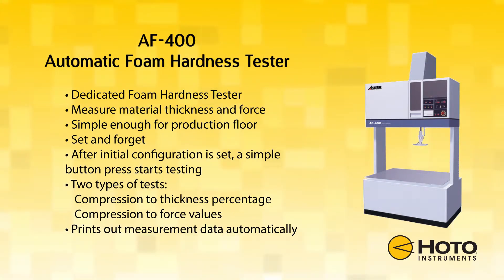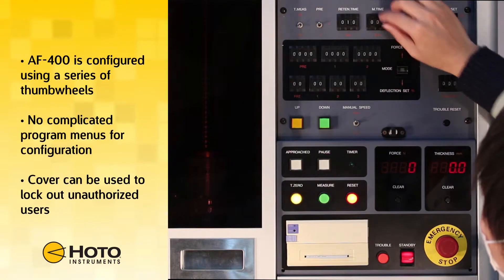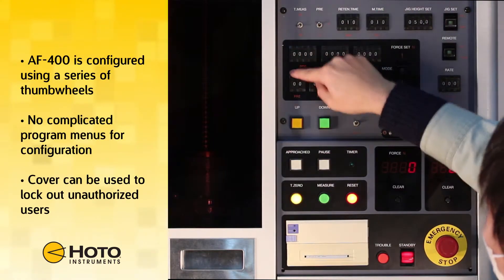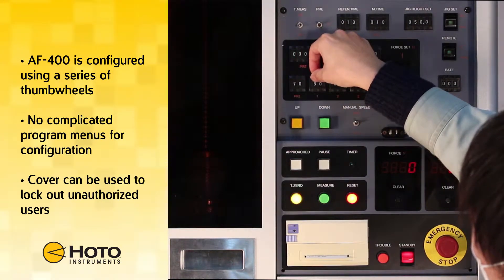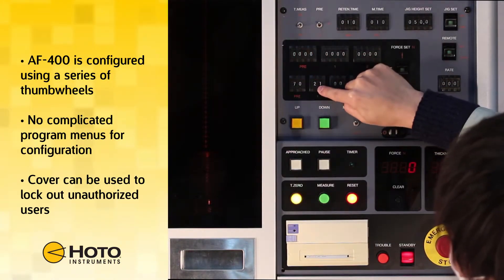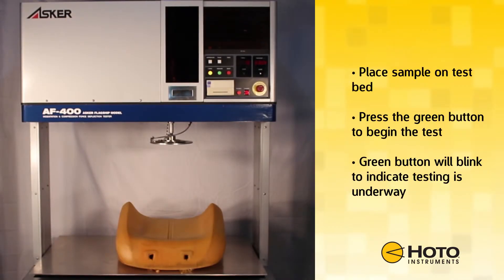Once tests are completed, the measurement data will be printed out automatically. The AF400 is configured using a series of thumb wheels. No complicated program menus are required for configuration. A cover can be used to lock out unauthorized users.